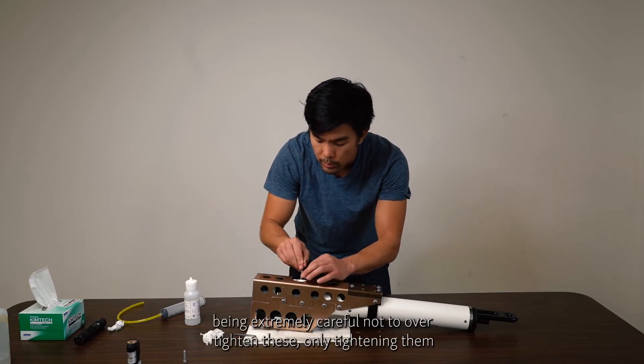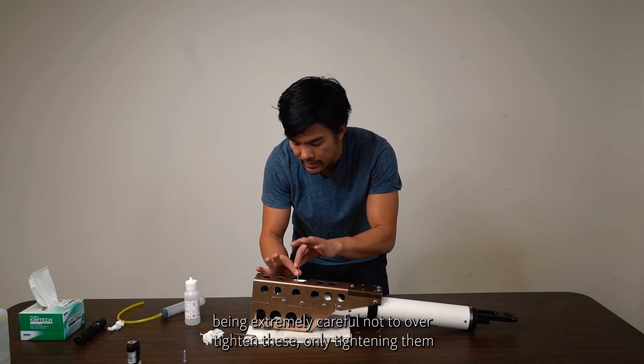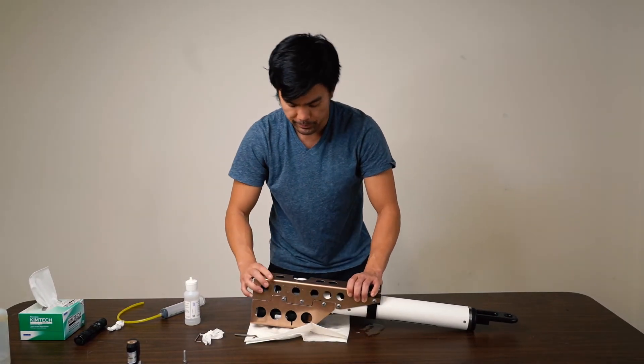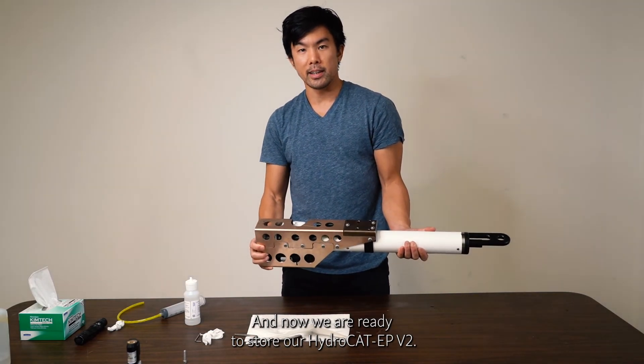Be extremely careful not to over-tighten these — only tighten until snug. Make sure it doesn't shake back and forth, and we are ready to store our HydroCat EP V2.